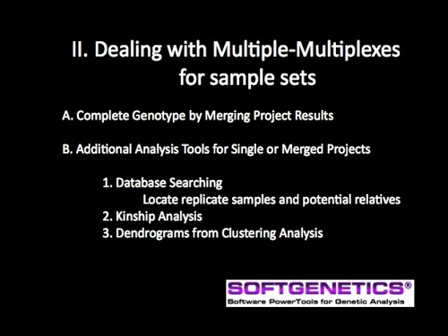These data sets must then be combined into one complete genotype before continuing with post-genotyping analysis. Traditionally, this is accomplished in spreadsheets manually by the researcher. GeneMarker's Project Merge tool eliminates this error-prone process of data transfer by automating the merge of allele calls from different multiplexes. In the second half of the webinar, we will use the Genotype Merge tool to provide a genotype of 15 markers from three GeneMarker projects.